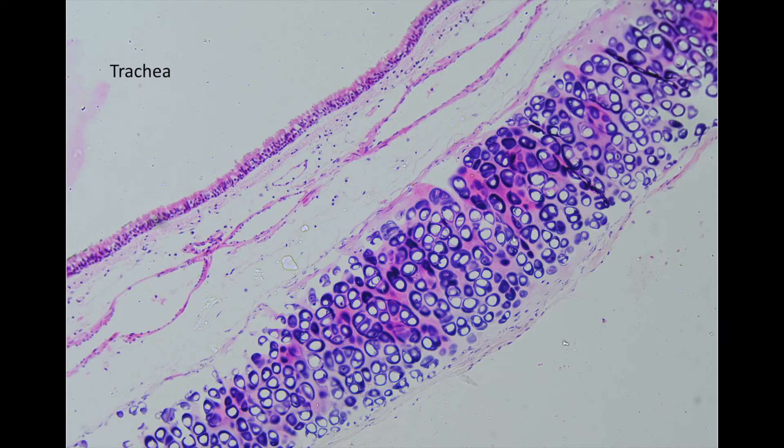To assess the lenses and compare them, I'll be using a slide containing a cross section of trachea. This has really fine detail which will be great for assessing the resolution of the lenses across the microscope field. The trachea is the windpipe which allows movement of air into and out of the lungs. I've created a simple schematic — in the upper left-hand corner we see two rings: the inner pink ring representing the inner layer of the trachea, and the purple representing the outer layer which looks like a rocky or cobblestone road.